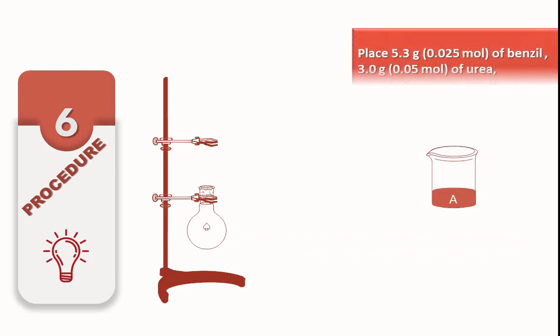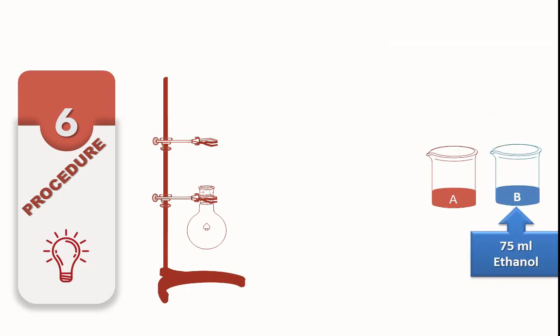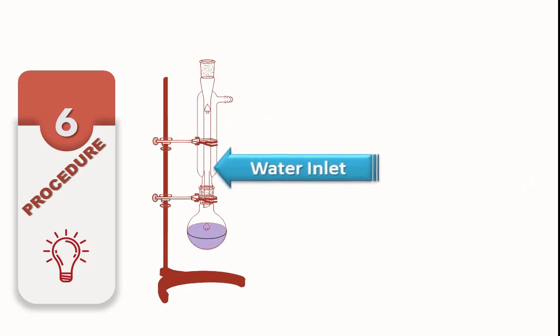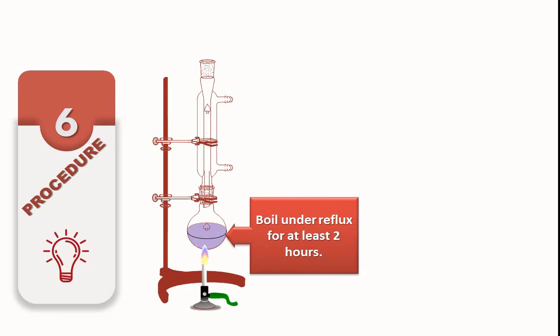Pour all reaction mixtures into the RBF, then attach the reflux condenser. Attach water inlet and outlet systems, then start the reflux for at least two hours.